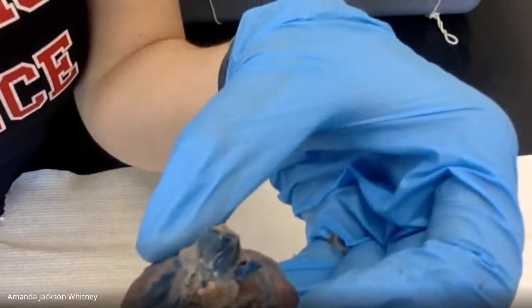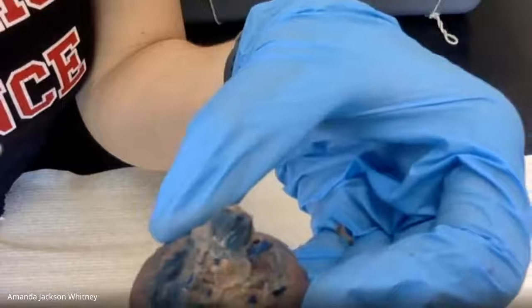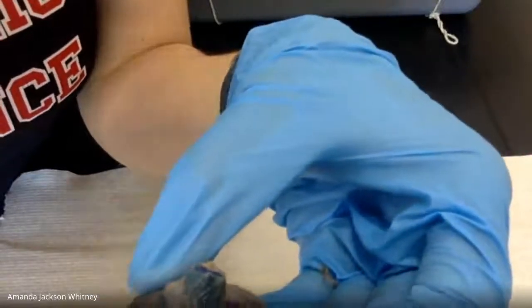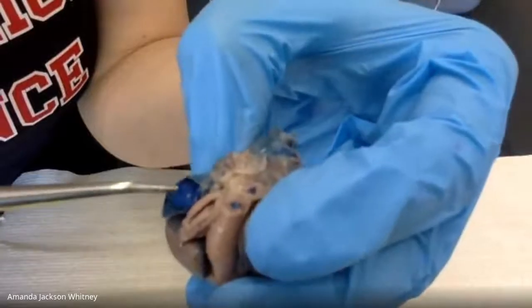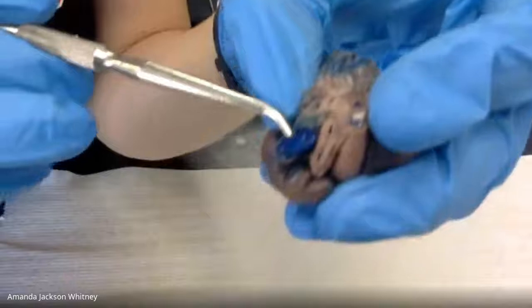There's a sac at the heart of them. Yeah, cut through that. Oops, sorry. So going in and out of view. I know it's really hard. Do veins bring blood to the heart or away from the heart? Yeah, veins bring blood back towards the heart.